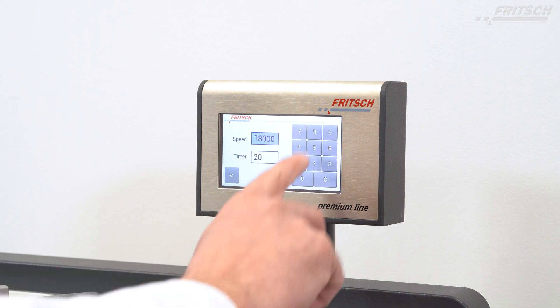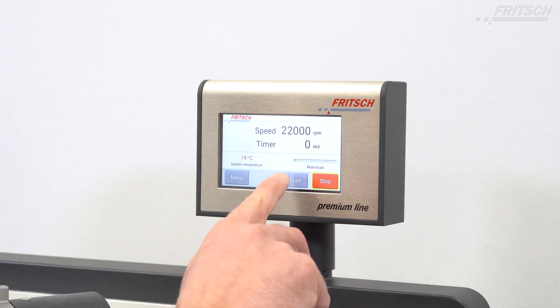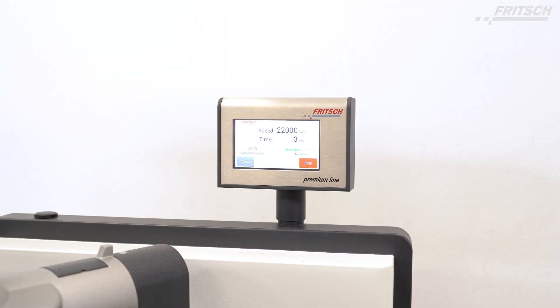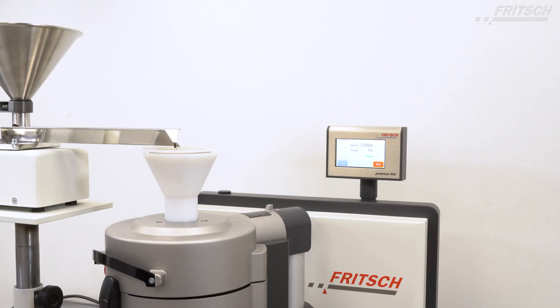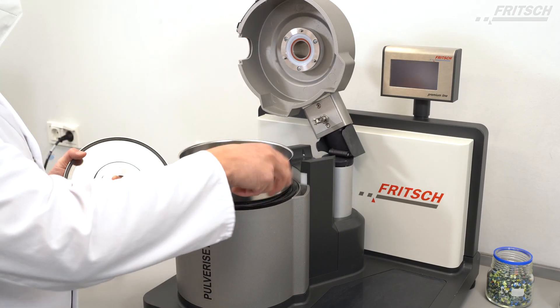The mill is operated via the ergonomically arranged touchscreen with intuitive menu structure in different languages. Enter the variable rotational speed and define the grinding time in minutes and seconds. A stopwatch function facilitates time recording, for example for new samples. The display of power consumption and system temperature ensures easy control, and a warning is shown in case of overload and overheating.